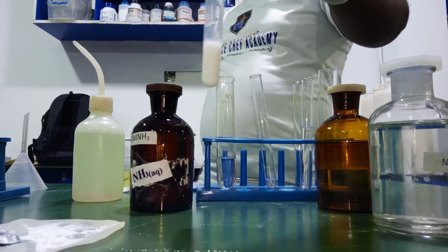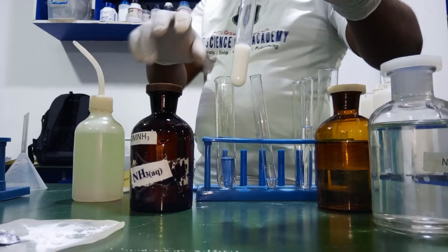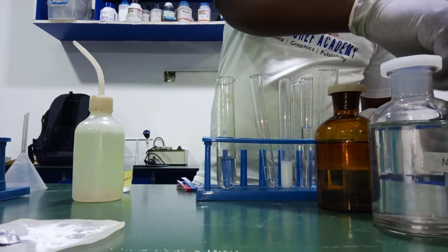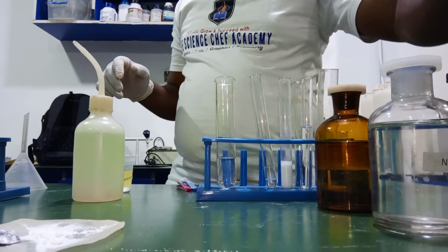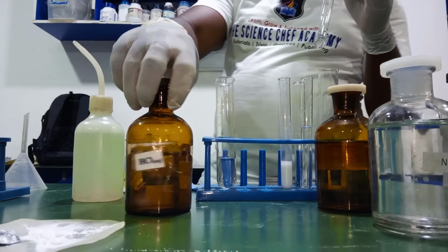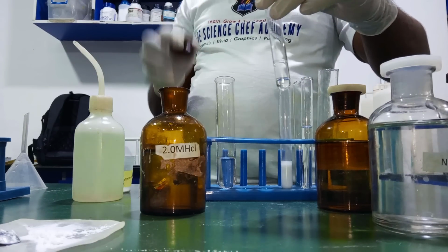And given the type of precipitate that forms here, it looks like a chalky precipitate. But let's try to carry out the confirmatory test for Pb2+ by adding HCl.